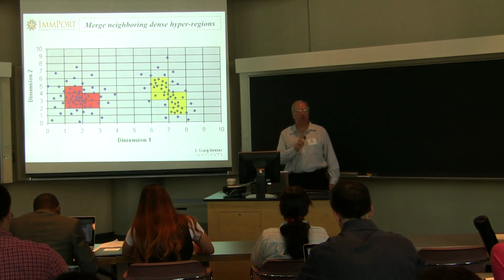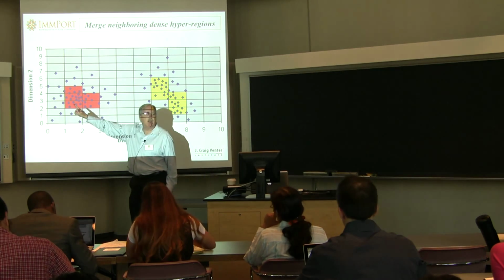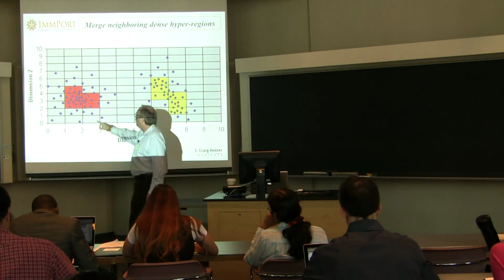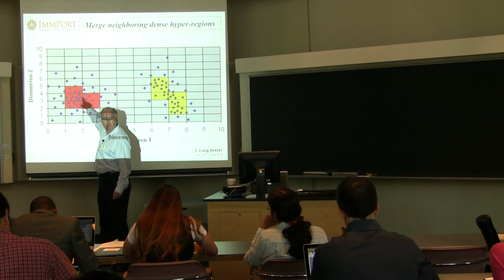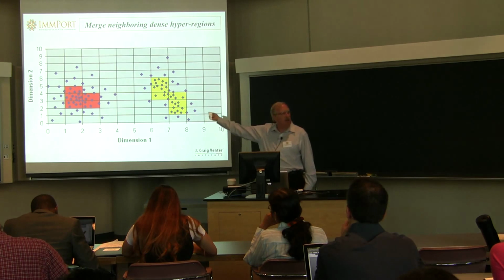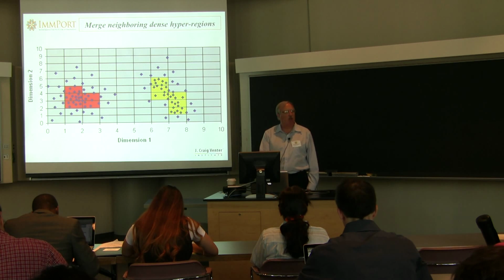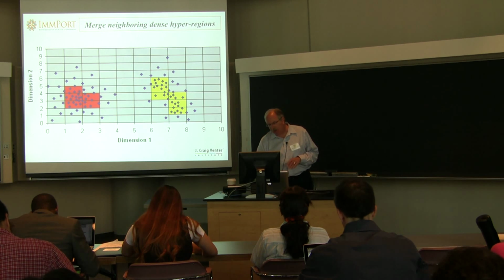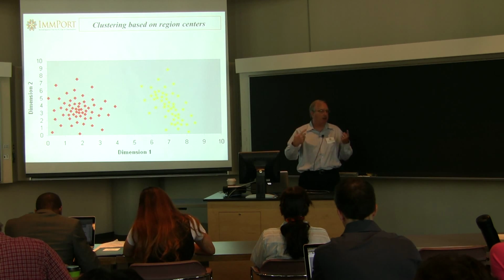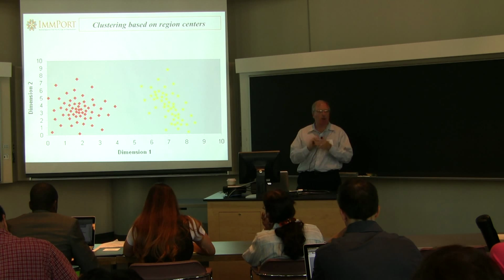Now this has done 2 things for us. First of all, it has told us how many populations we're seeing in this n-dimensional space, and it allows us to estimate the center of the distribution of the different dimensions for each population. Then we can calculate a centroid for the center of each of these distributions and do a single round of clustering to give us the solution that we're looking for. Again, this ended up telling us how many populations we're seeing, taking a data-driven approach, and it has estimated the center of the distribution of each of those regions.